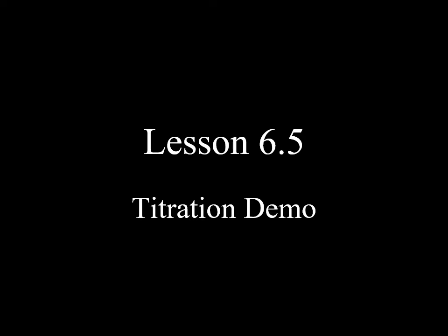All right, so this is a PowerPoint that I normally do in school. And while I'm doing it, I do actually demonstrate the titration lab procedure. So clearly I'm not going to be able to do that today. I'm doing the best I can by putting some more pictures into the PowerPoint to try to demonstrate the idea.